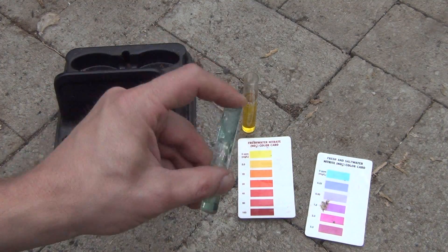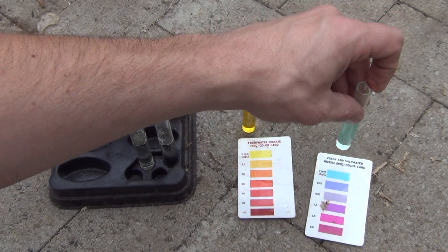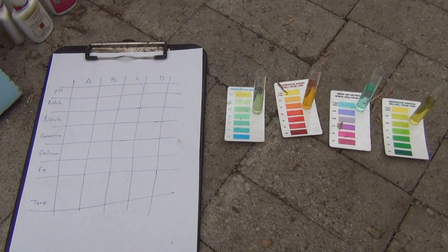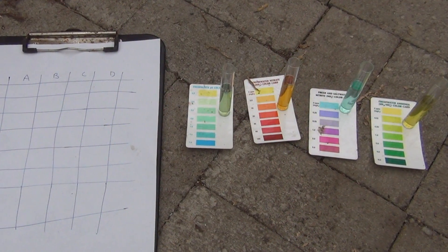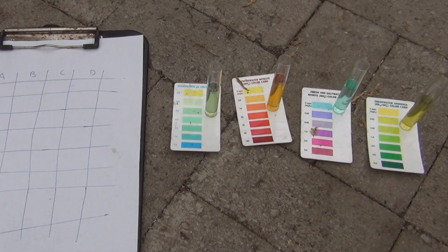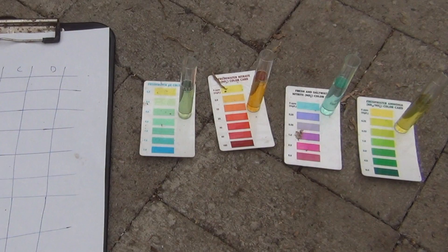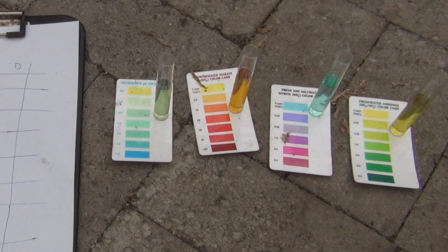I really should be putting the lids on these, but I don't feel like it. At the fish tank, the pH is 6.6 — which is very difficult to tell with these API test kits using the color chart, but that's about what it is. Nitrates are at 10 parts per million, nitrites at zero, which is pretty typical for me, and ammonia is 0.25 parts per million.